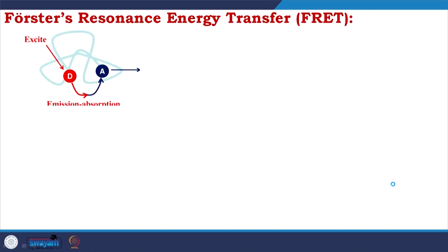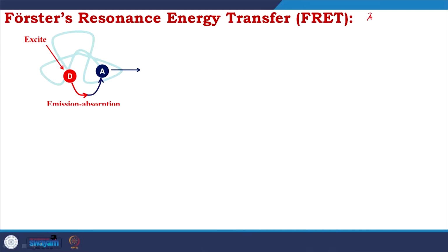Coming to Förster resonance energy transfer, or FRET. What is the concept of FRET? If you have a fluorophore A, you excite it. So you have an excitation wavelength, and you get an emission.